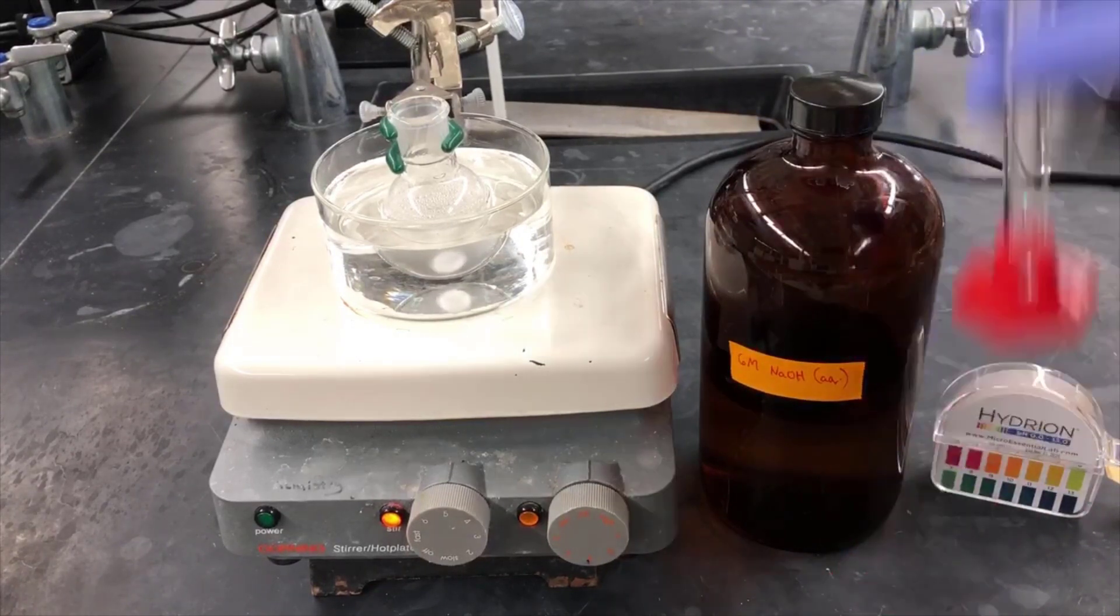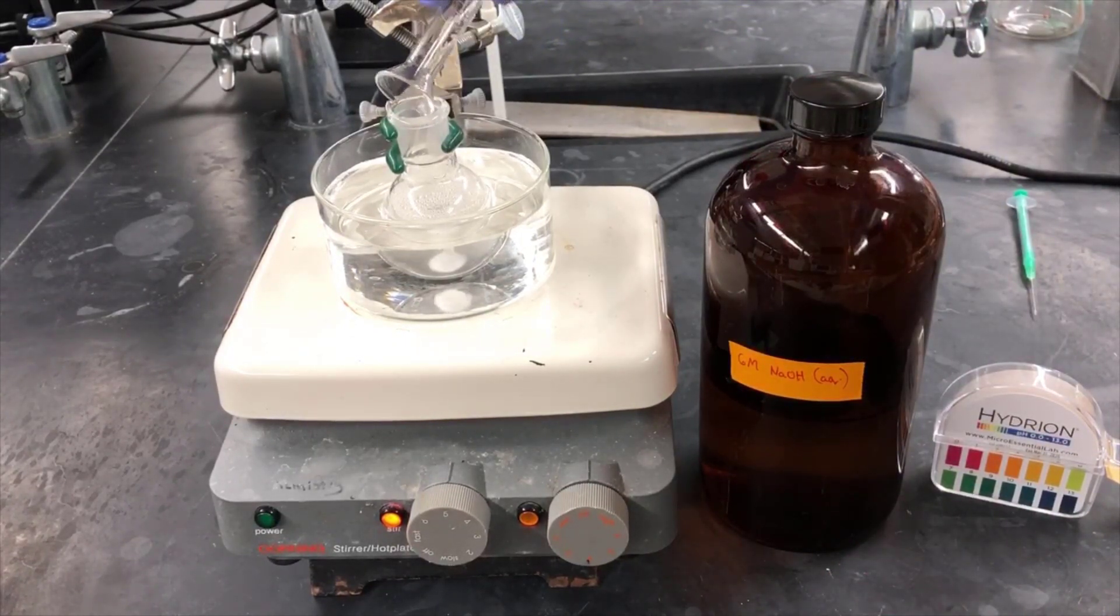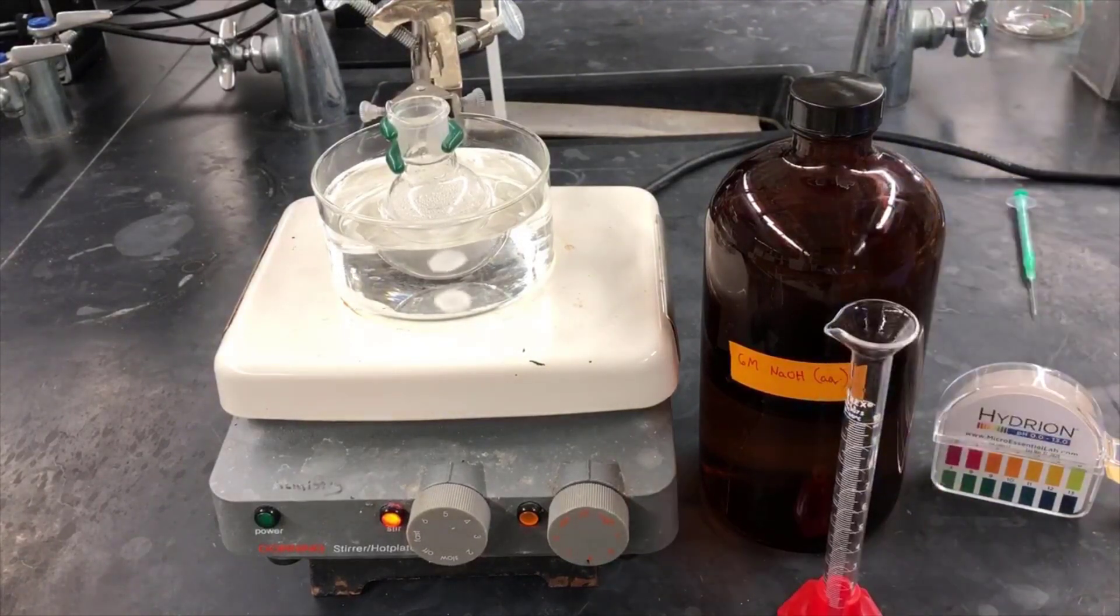The point of adding the sodium hydroxide is to deprotonate the acetic acid catalyst that we added in the reaction. Acetic acid is volatile, and it could co-distill in the next step. Converting it into a salt makes it non-volatile and prevents it from distilling over.